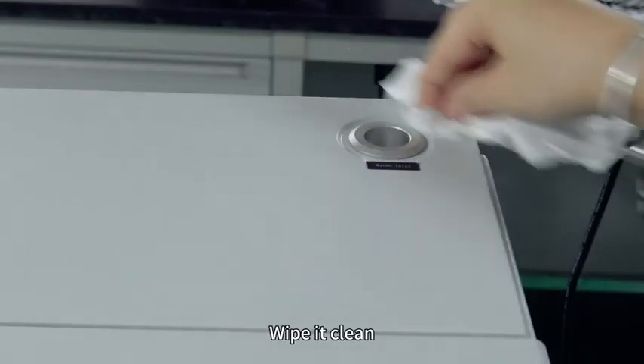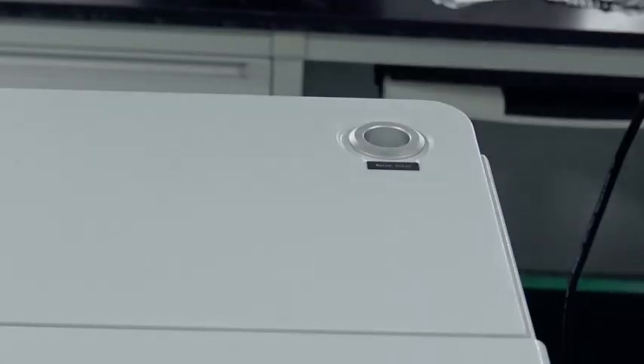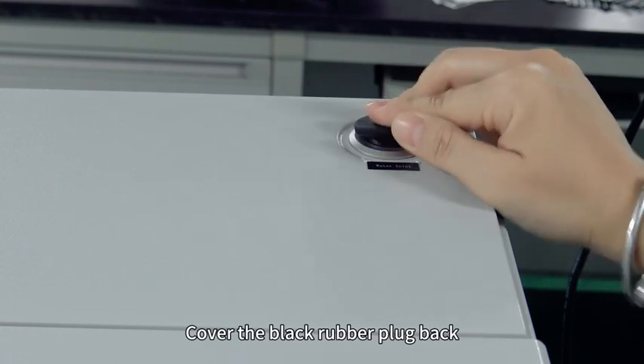Wipe it clean, then cover the black rubber plug back.